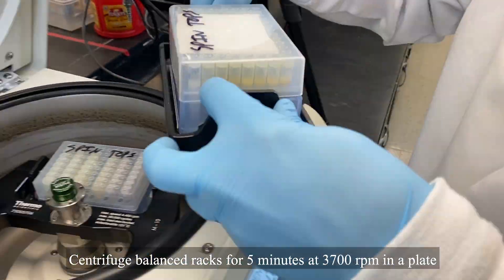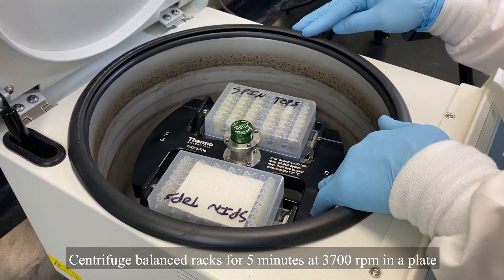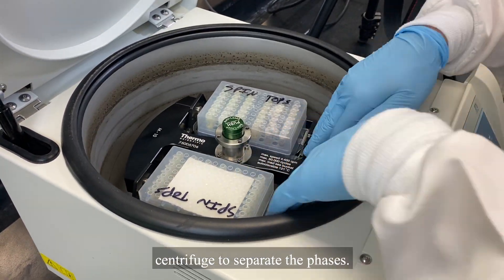Carefully balance the paired spin racks with a Harvard trip balance or scale. Centrifuge balanced racks for 5 minutes at 3700 RPM in a plate centrifuge to separate the phases.